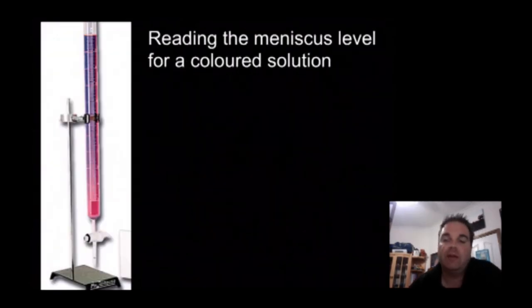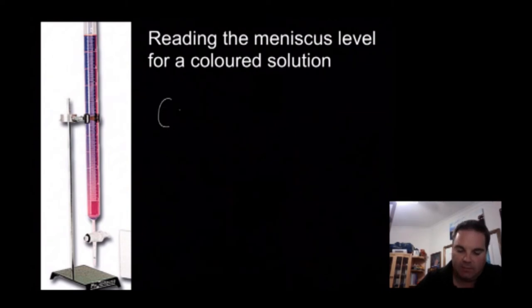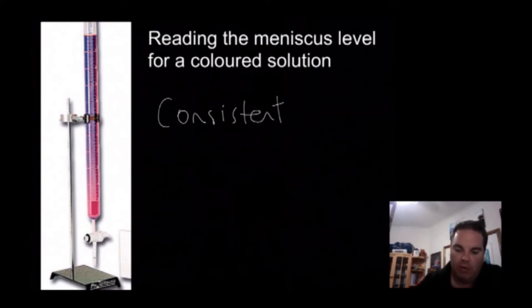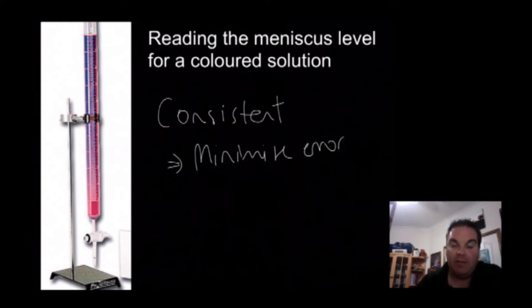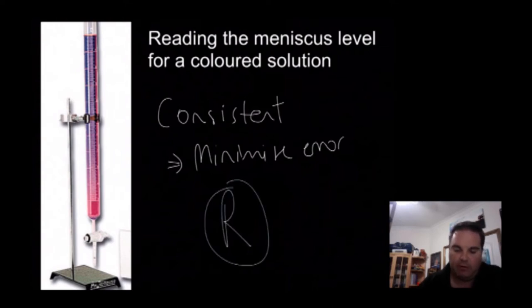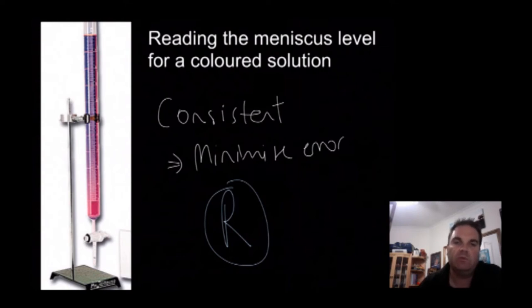Next is reading the meniscus level for a coloured solution. When doing titrations involving permanganate, for example, it's very difficult to read the meniscus effectively. The key is to be consistent - if you always read at the same level, you'll minimise your error. Every time you read it, it might be slightly different because of the difficulty of seeing the bottom of the meniscus. This is a random error. But if you're consistent about sometimes reading at the top of the level rather than the bottom of the meniscus, that can help minimise your random errors.